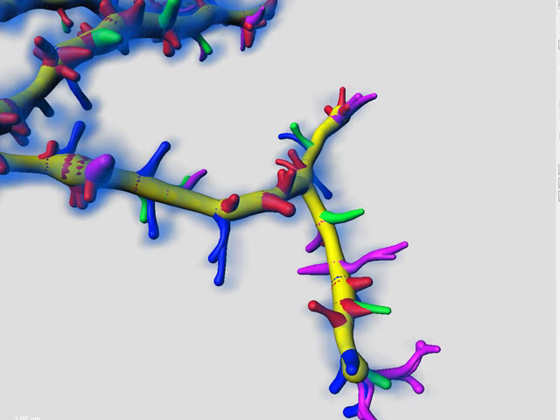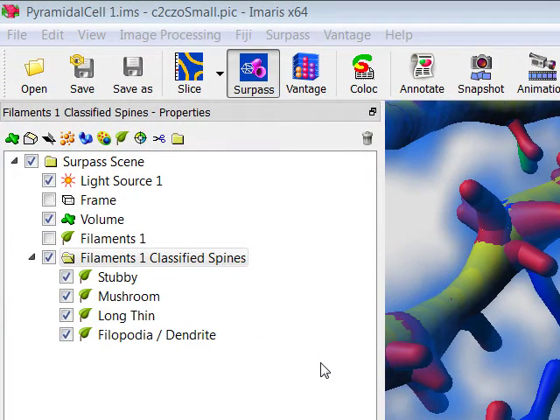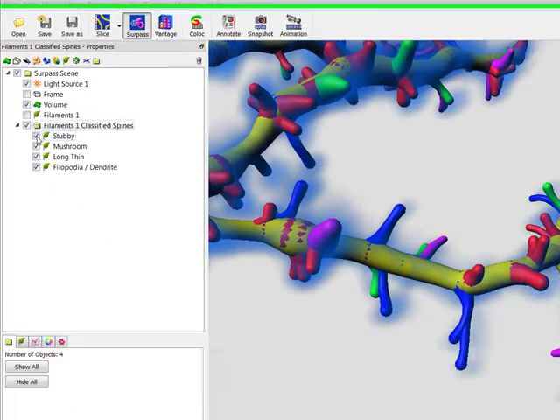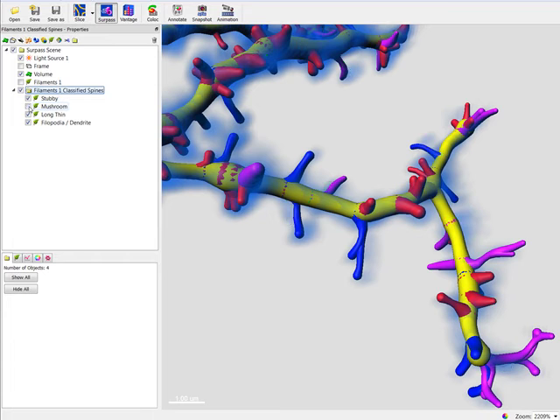In the viewing area, the four groups of spines are displayed in different colours. In the surpass tree, the new filaments object group is created. The filament object is named according to the spine class, and all spines in the same class are assigned to the same filaments object.